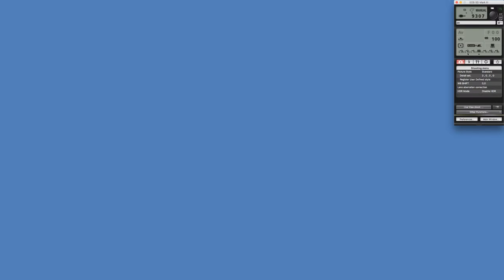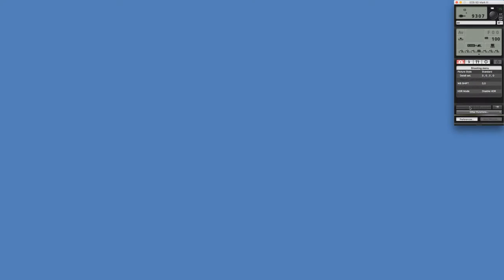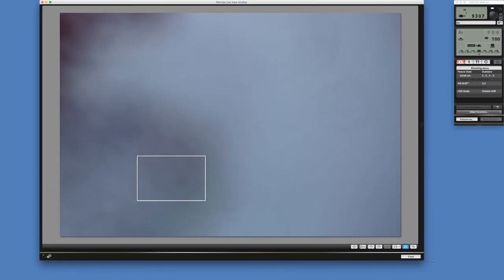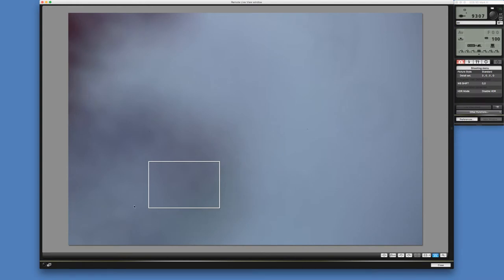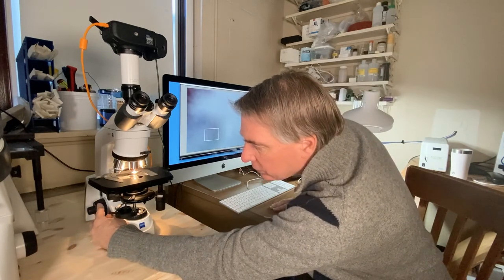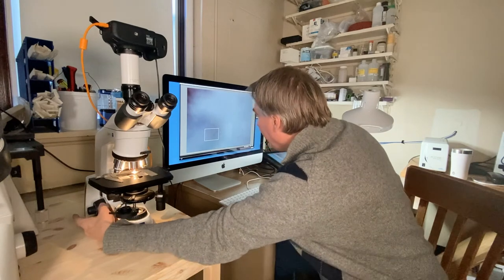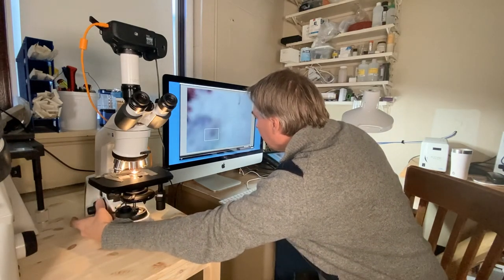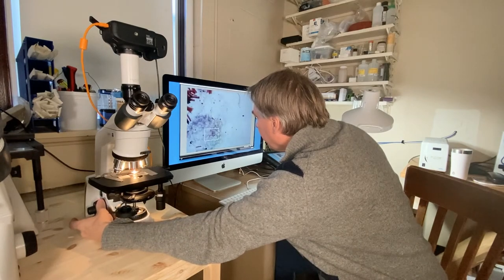When the camera is connected and the power is on, a box comes up and you can select camera settings remote shooting. When you do that, a control panel comes up and we go down to live view shoot. I click on that and now this window shows what the camera sees in real time. You can see there's a sample that's out of focus. To focus the microscope we have a coarse focus knob and a fine focus, which is the smaller outer knob, and I'm going to focus the sample.